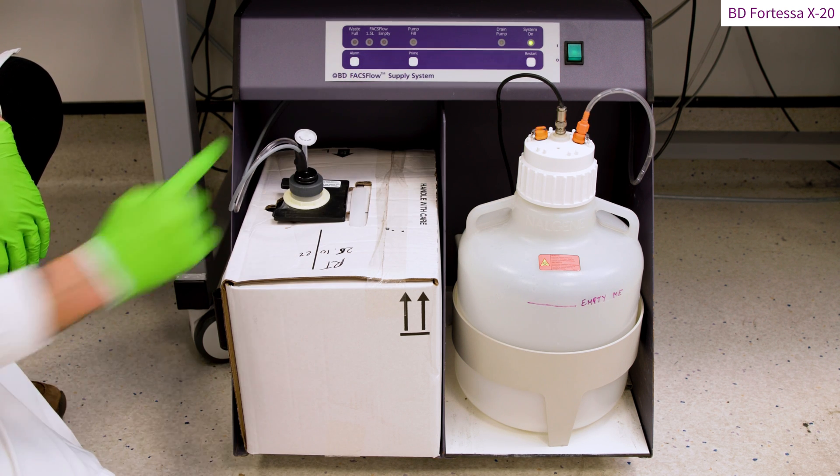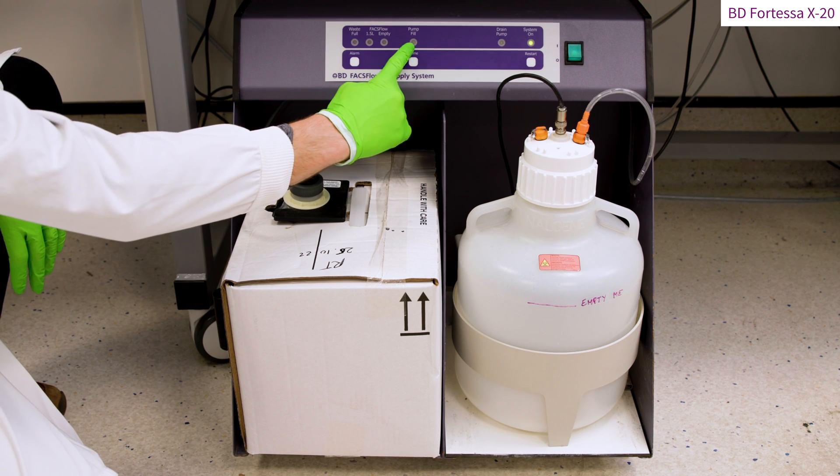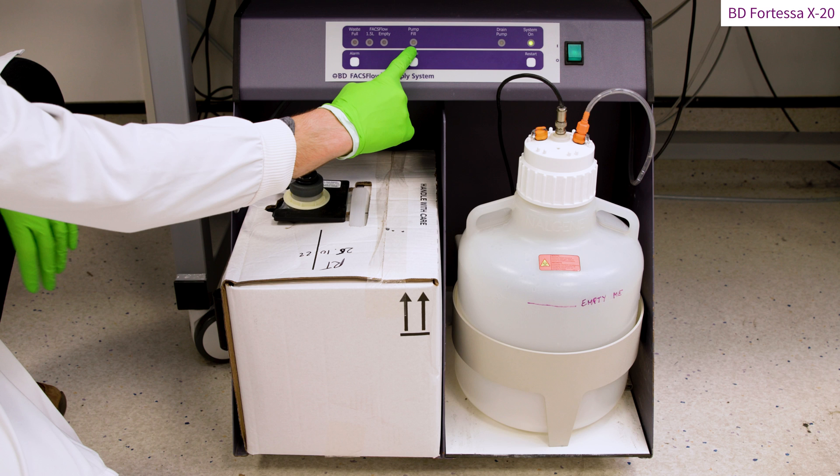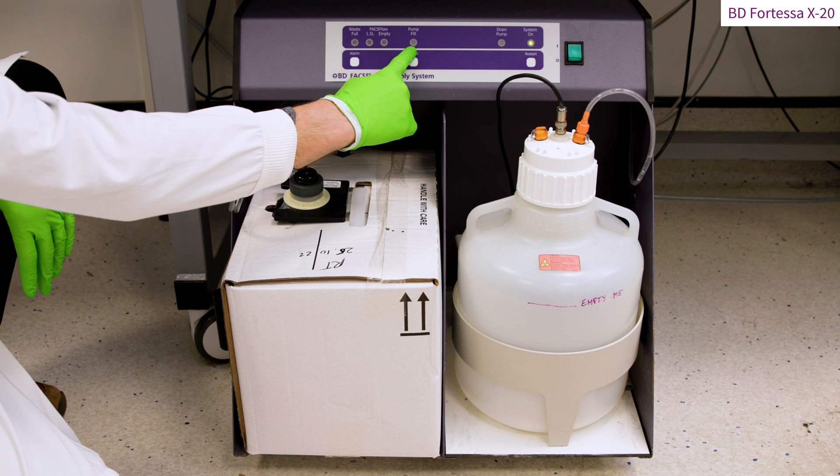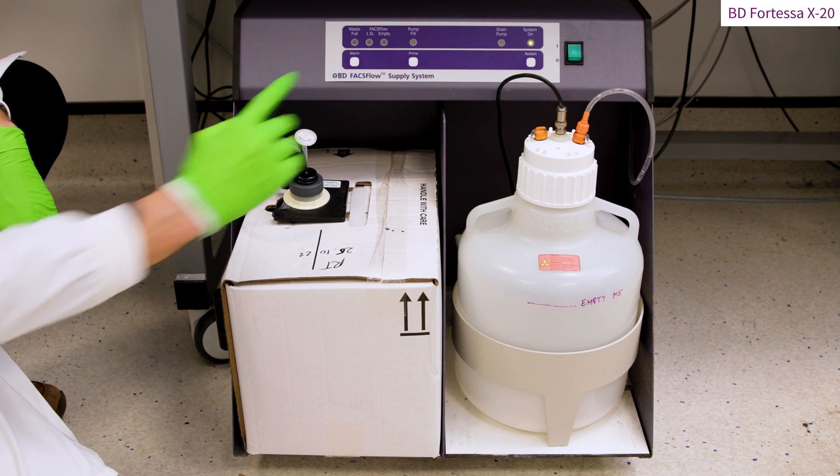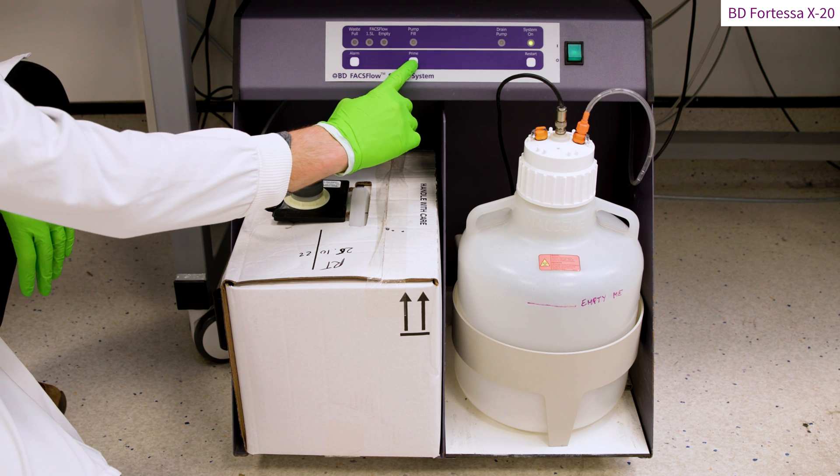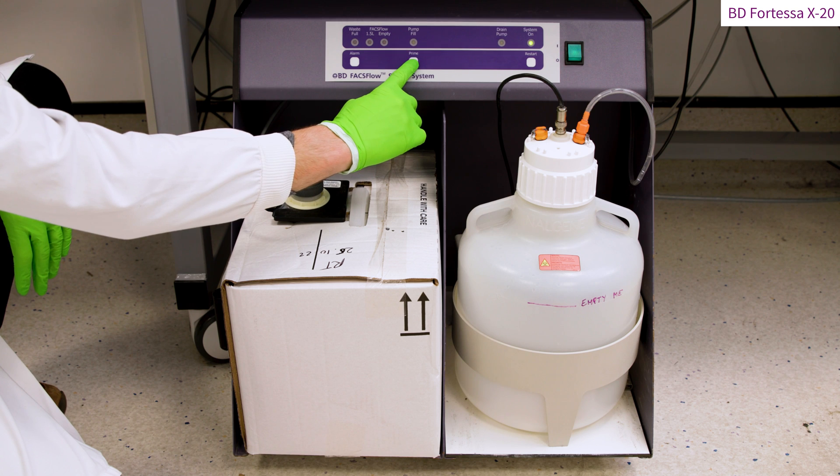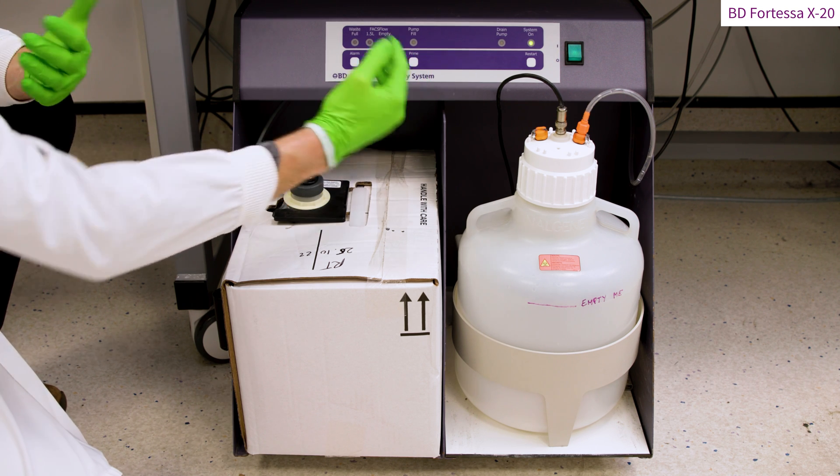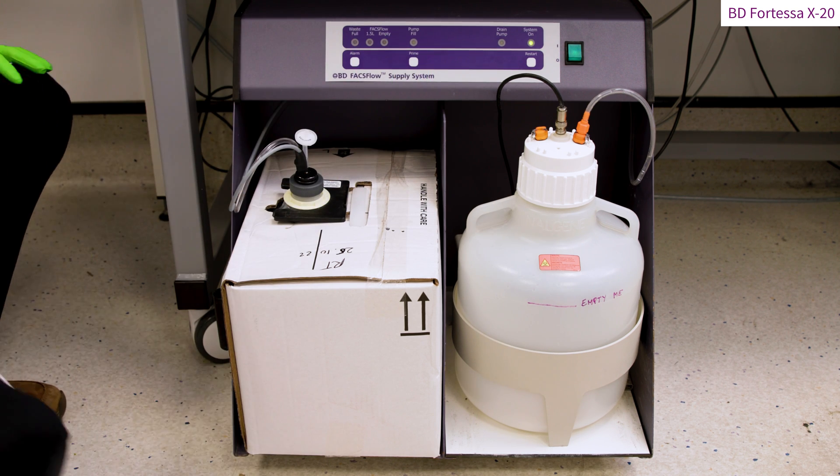Following the sheath fluid tank replacement, the fluidic cart might start pumping fluid towards the Fortessa. The pumping is characterized by a specific noise as well as an orange light on the pump fill indicator LED. To accelerate the pumping process, press on the prime button located under the pump fill indicator LED.